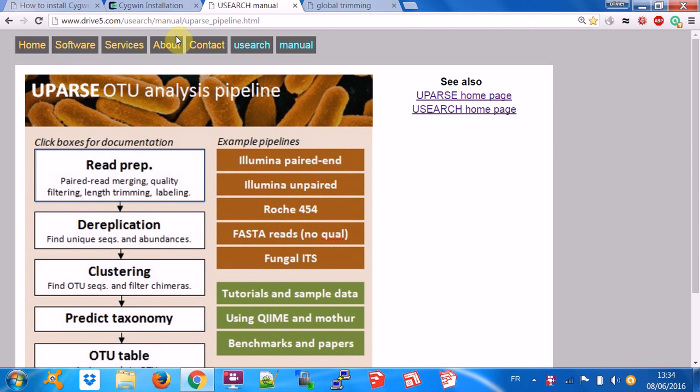I'm going to use here only a few options of all the possible steps, which are basically fitted to my type of analysis, and that's the V3, V4 region of the 16S gene, analyzed with Illumina MiSeq. Before you begin, we will review all the files that you need, and then we will go through a quick analysis together using just 2 samples.